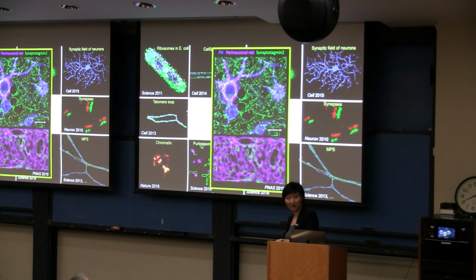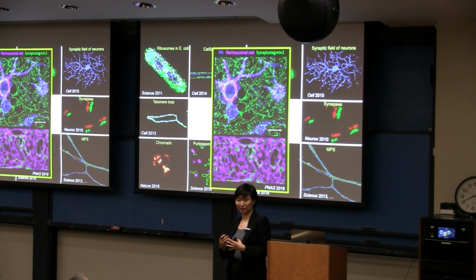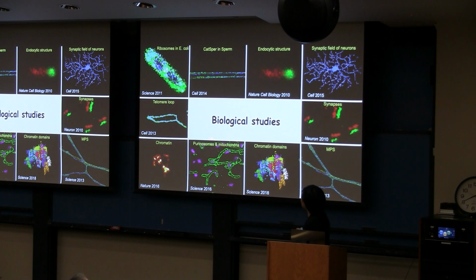This is a more recent study where we looked at an extracellular matrix called the perineuronal net in collaboration with the Takao Hensch lab at Harvard MCB. And then we saw interesting differences in structure, both in terms of this perineuronal net and how it interacted with synapses, in an autism model, actually in the Rett syndrome model where the MECP2 molecule is depleted.